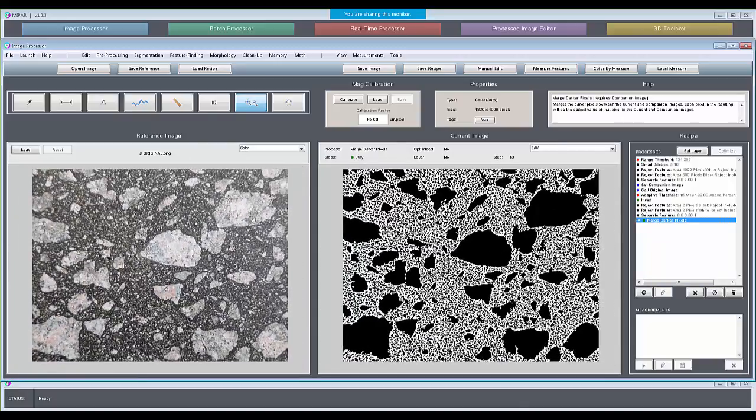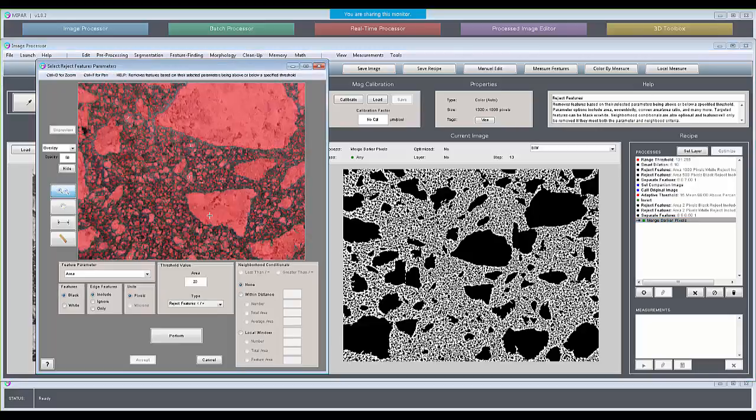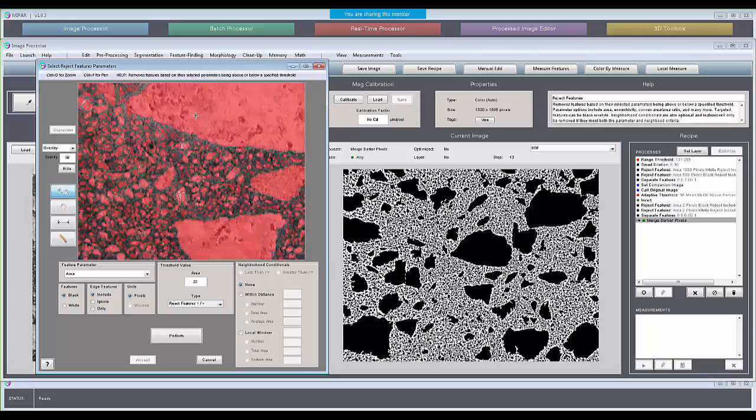So now I've got separated large ones, separated small ones in the same image. So this is all of my particles. And I can now do some sorting. So let's first just reject. I got to decide what I want my cutoff to be. So I could make a quick histogram and see what the cutoff should be, which is why histogram plotting tools we know would be nice in MIPAR.